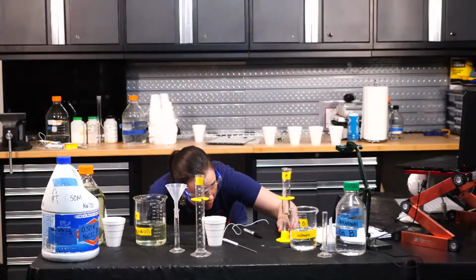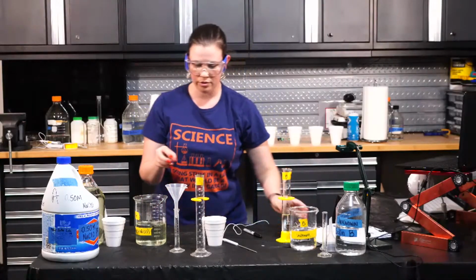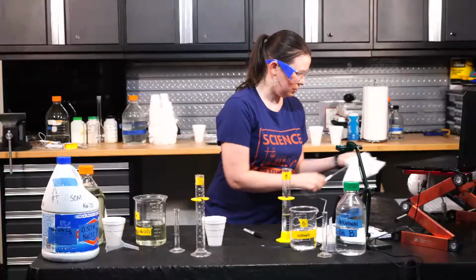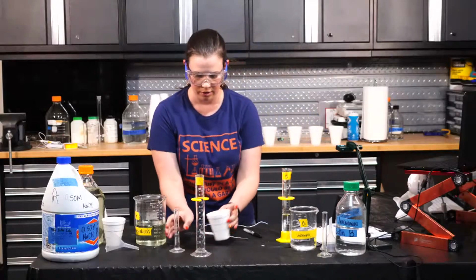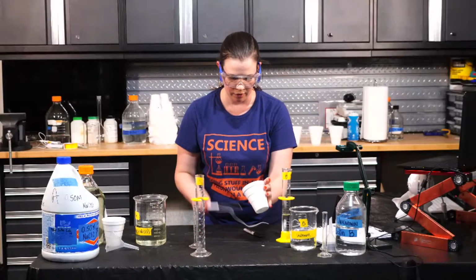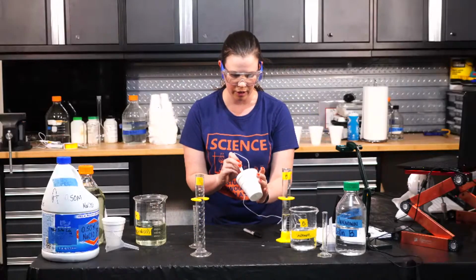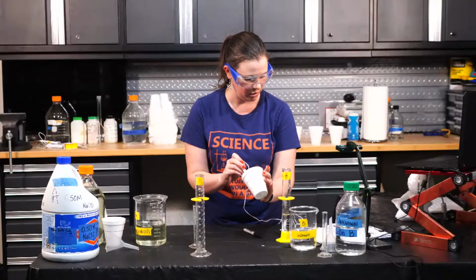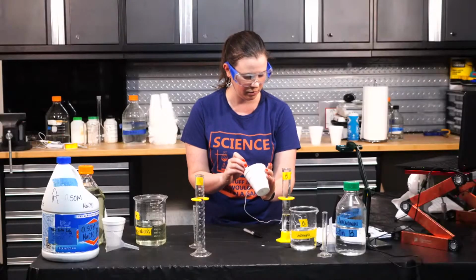And let me double check the volume on this. 45 milliliters. Wipe this off again. Put our 5 milliliters in. So now again, we're going to kind of gather the liquid on the side. And that looks better. We got 19.0 this time. 19.0 to start.